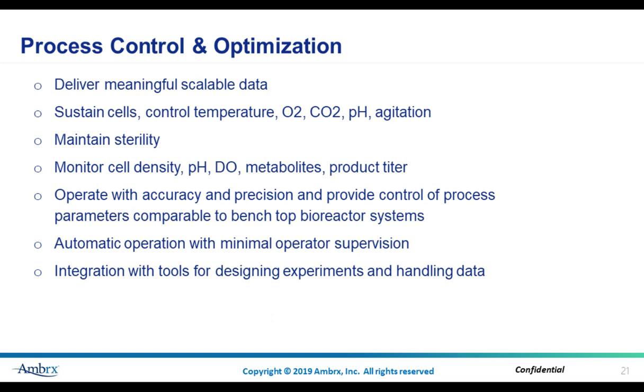Culture operating parameters include physical, chemical, and biological parameters. Physical parameters include temperature, gas flow, and agitation speed, while the chemical parameters include DO, CO2, pH, osmolarity, and metabolite levels, including substrate, amino acid, and waste byproducts. Biological parameters are usually used for determining the physiological state of the culture and include VCD, viability, and more.